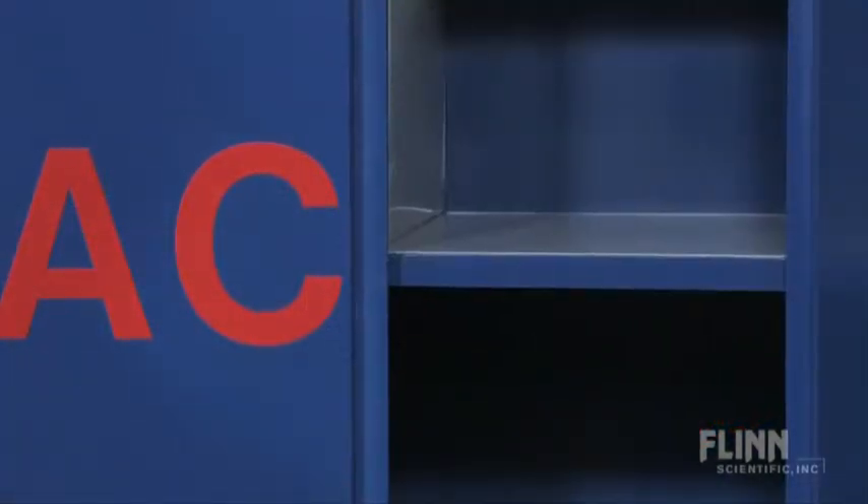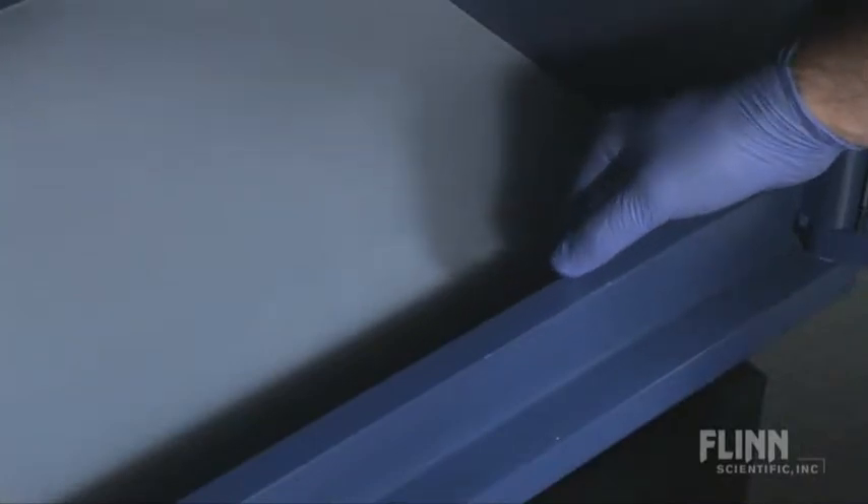The Flint acid cabinet includes one fixed-position shelf, and the floor has a two-inch liquid-tight trough to contain any spills.